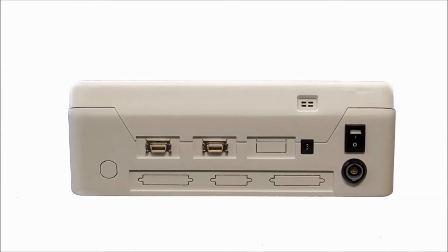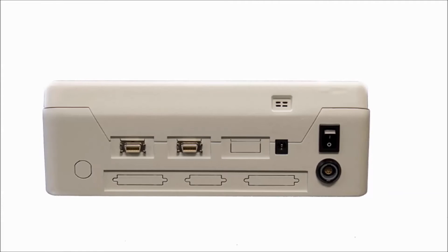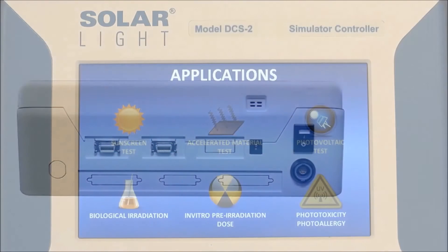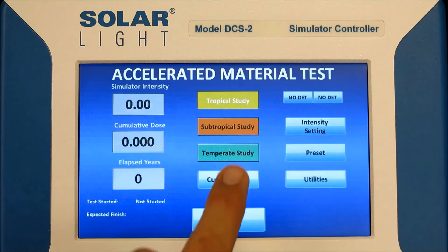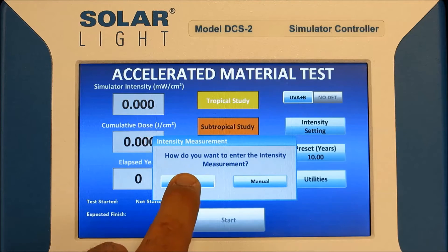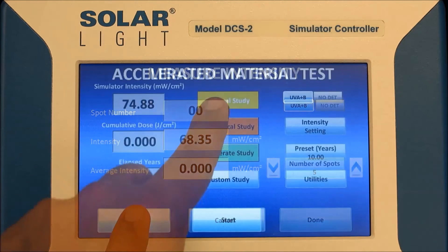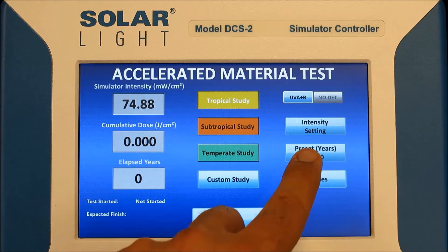The 7-inch touch-sensitive screen allows the user to follow intuitive menus and makes it easy to set control parameters. Pre-programmed data from the intelligence sensors also makes setting up a test much faster. In the event of a fault arising during a run cycle, the DCS-2 provides a visual fault indication and automatically closes down the simulator, saving time and reducing the chances of false reporting. This unit presents the state-of-the-art methodology required in a busy testing laboratory.